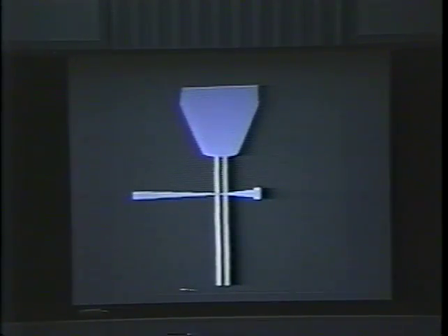In a cell sorter, cells are suspended in a liquid and forced under pressure in single file into the center of a fluid stream. The stream passes through a vibrating nozzle, which causes it to break up into droplets, up to as many as 40,000 a second. Below the nozzle, and before the stream breaks up, it passes through laser light, allowing measurements to be made by sensors, particularly if cells have been tagged with fluorescent materials which shine in the laser beam.